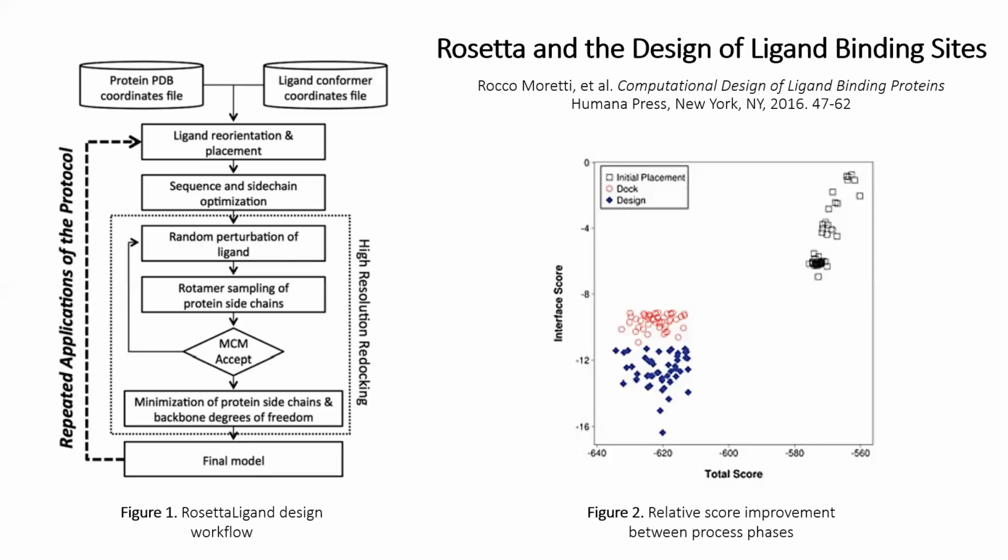They then go on to supplement the initial metrics with more computed by Rosetta's interface analyzer, and they repeat that filtering process only on the pre-filtered collection of structures. And they suggest iterating through that process as additional metrics and their thresholds are generated. And that gets them to this blue section, which is more of the final design structures. And again, you see an even bigger improvement in both the interface and total score on average.